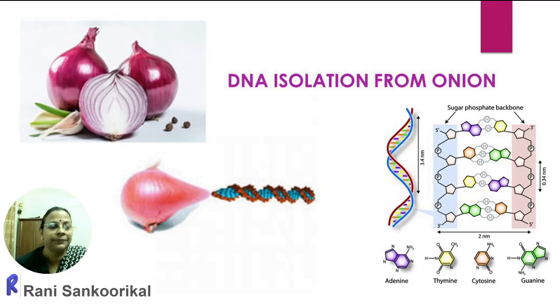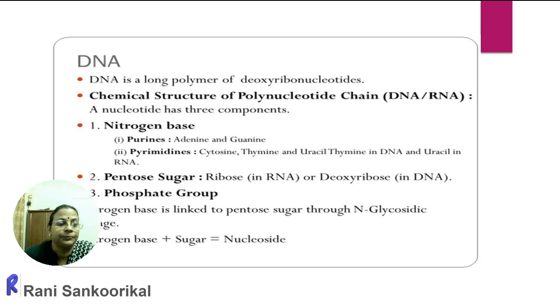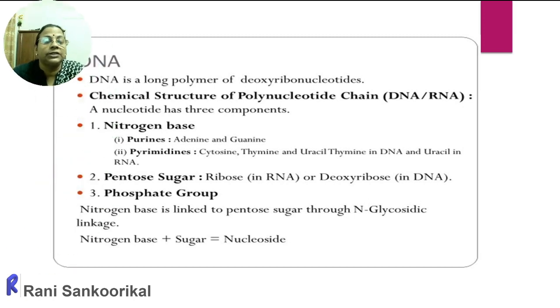Good morning, everyone. The second experiment for this term is DNA isolation from onion. The DNA is the carbon copy of all organisms. It is a nucleic acid which is present inside the nucleus in eukaryotes.